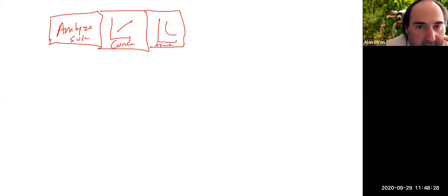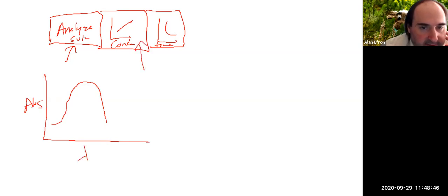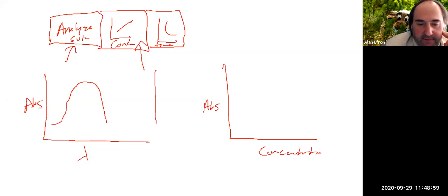So if you click on the Analyze Solution box, it will give you the absorbance versus wavelength graph. So you'll see that graph if you click on that box there. If you click on this box, it will give you that graph of absorbance versus concentration.